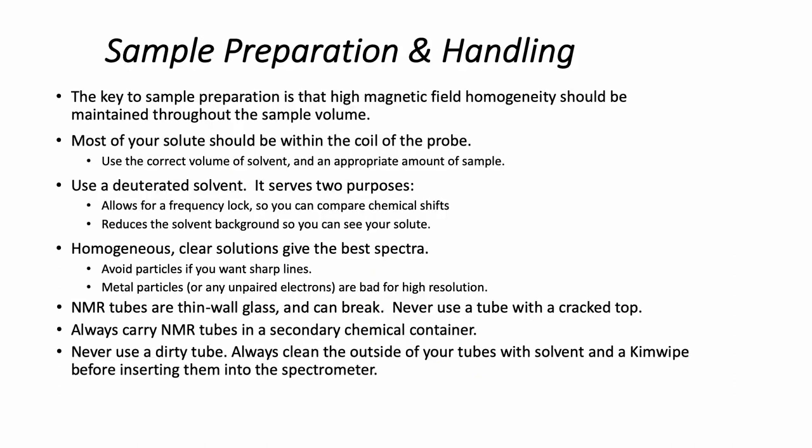Let's see, I'm almost finished. I think we're about out of time. Sample preparation. When you're preparing your samples, it is important to prepare clean samples. There should not be particulate matter in your samples. You should filter them if you do have particulate matter from your reaction, because having particles in there will lead to poorer spectra that'll be difficult to interpret.